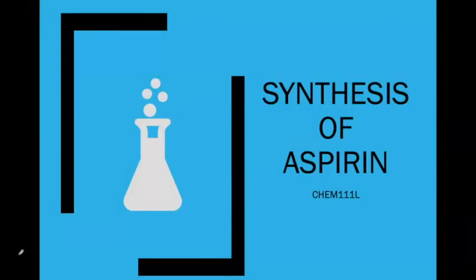Howdy. This is the video that introduces the experiment synthesis of aspirin we're doing in CHEM111L.